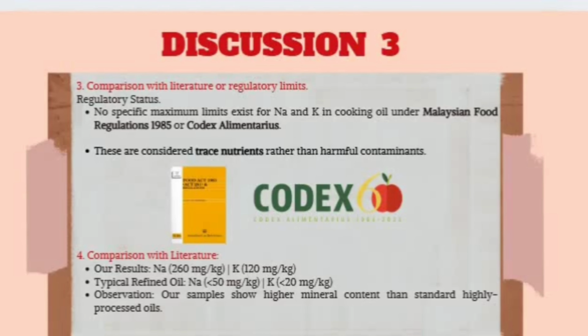Another comparison with literature is that based on our results, we got 260 milligrams per kg for sodium and 120 milligrams per kg for potassium. Typical refined oils are usually below 50 milligrams per kg for sodium and 20 milligrams per kg for potassium. So the observation here is that our samples show higher mineral content than standard highly processed oils. That's all for discussion 3. Thank you.